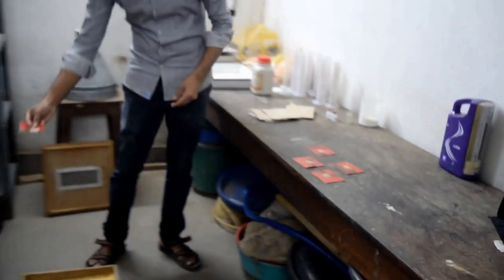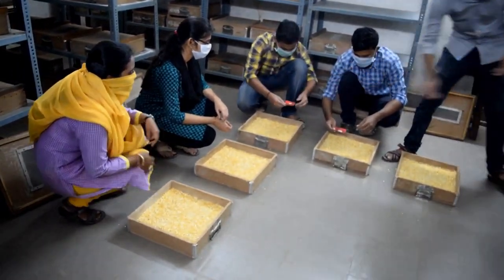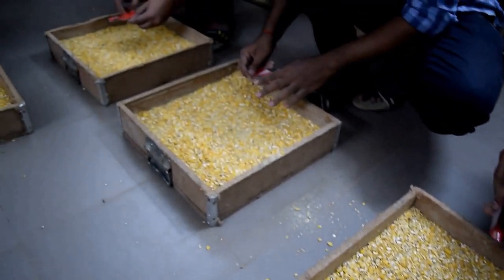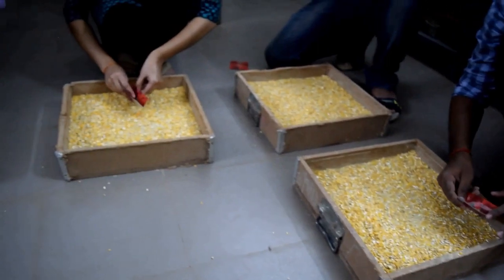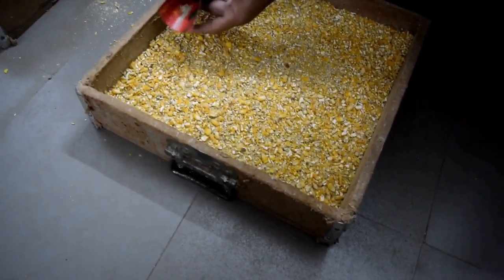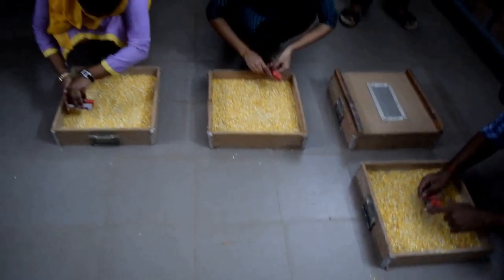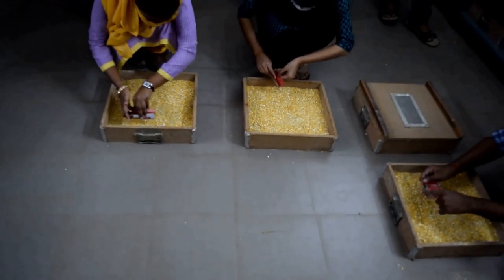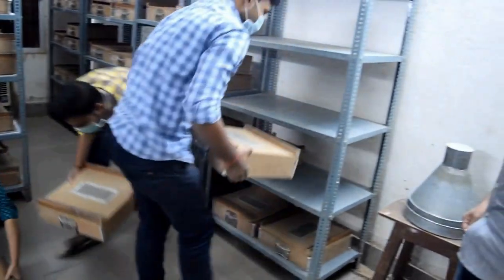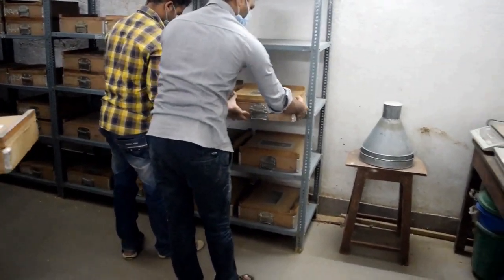0.5 cc of fresh egg of rice moth is sprayed over the grain surface as evenly as possible and the lid is closed. Boxes are arranged in the racks, and the date of preparation is written on the boxes with chalk.